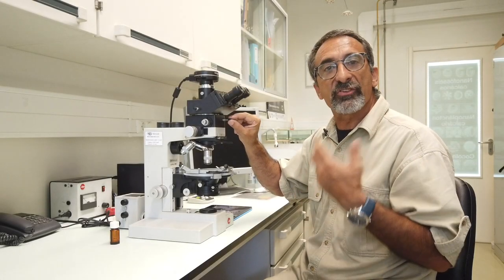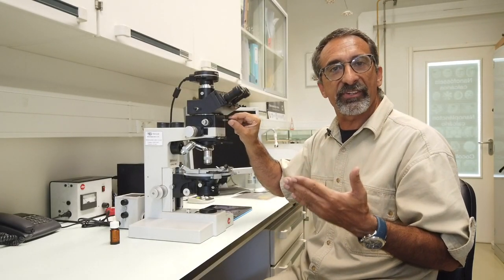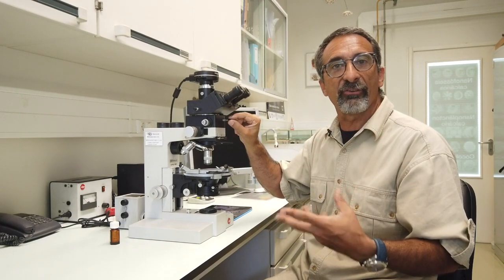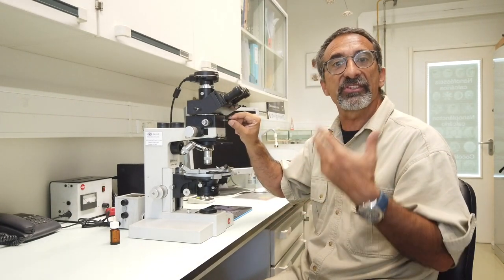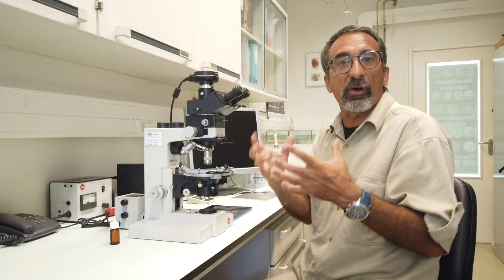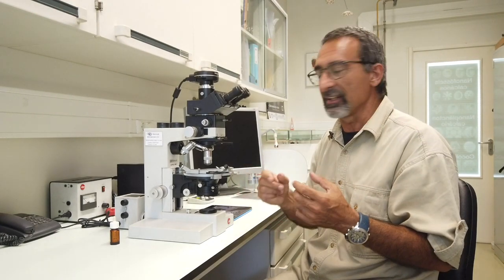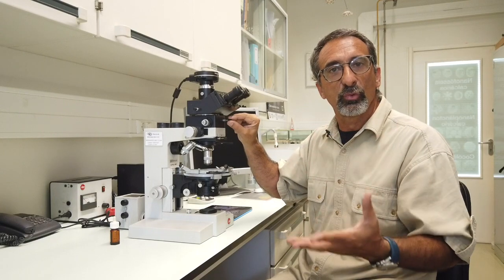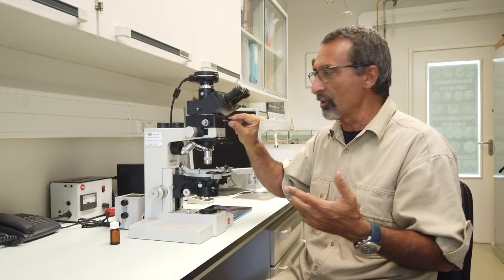Here we have an auxiliary lens, the Amici Bertrand lens, that normally we don't use with calcareous nanofossils, but in some cases is useful namely to determine the optical sign of the crystal. In our case we already know what it is. Calcite has a specific optical signal that we'll discuss later on. But this is also an important tool in a petrographic microscope.